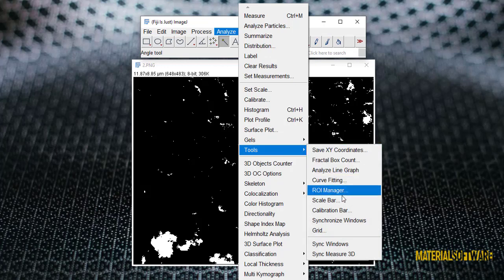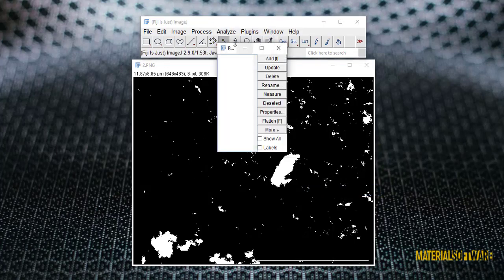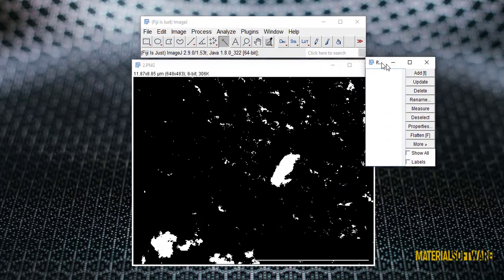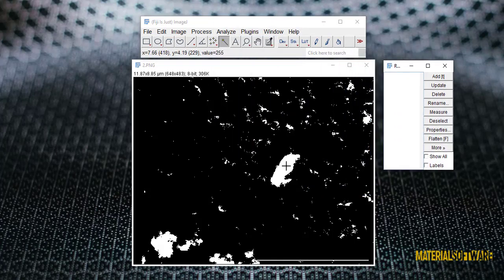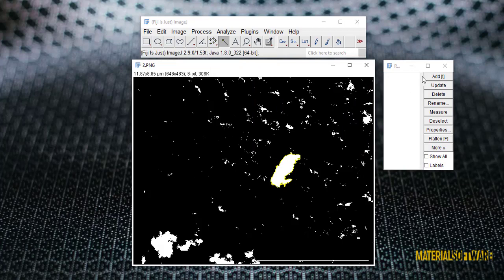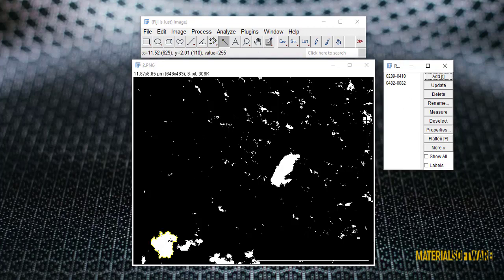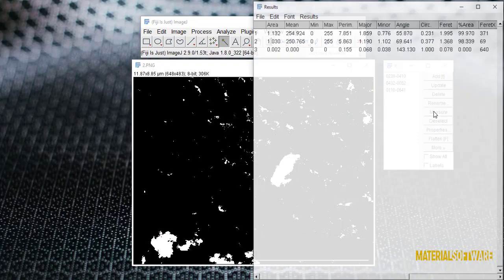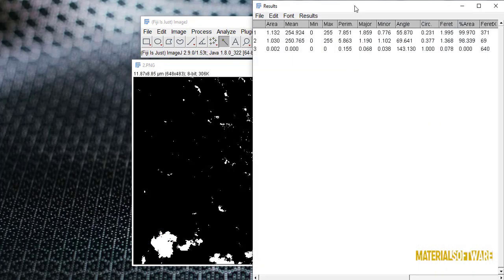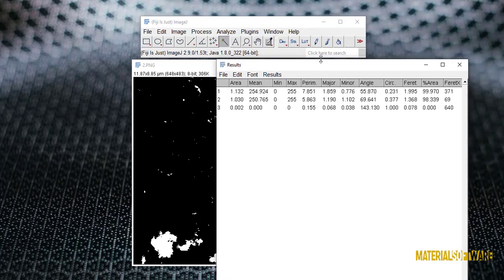Now we select the wand tool and in the analysis header, in the tool option we select the ROI management option. By clicking on the pores and pressing the add option one by one we enter the pores into the software, and at the end by pressing the combination key Control+A, we select all the points and select the measurement option.